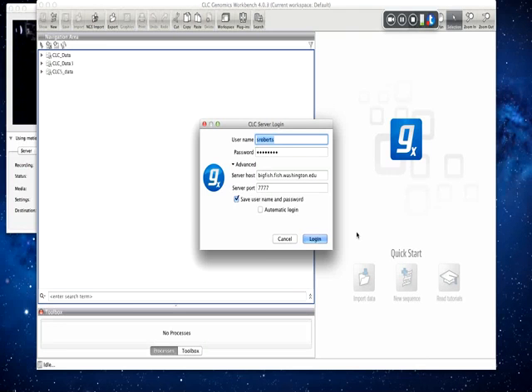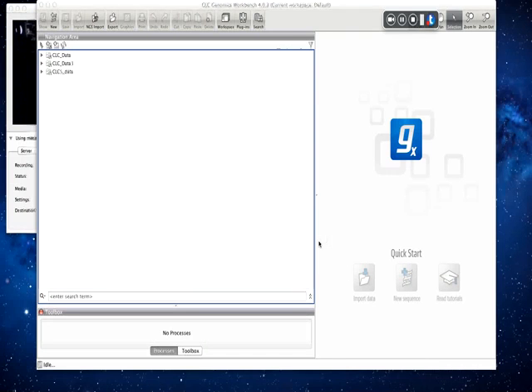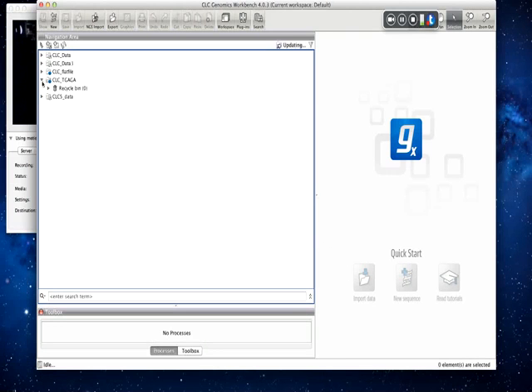We'll have to get confirmation of what the username and password is, but I think the username is fish546, but everything else is the same. You hit login. Then you have these two drives with blue dots. That means you're actually running the jobs on the server.